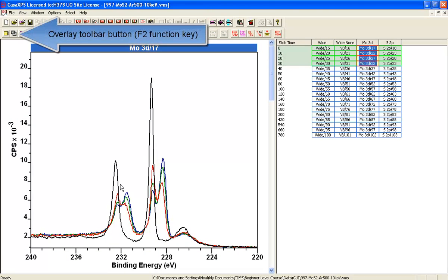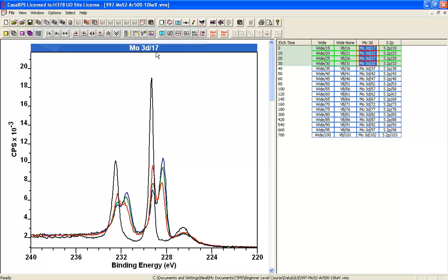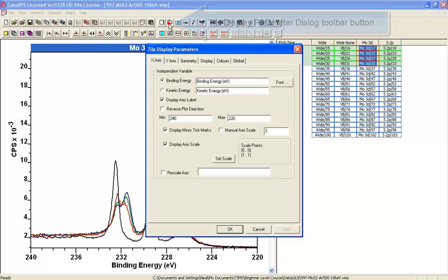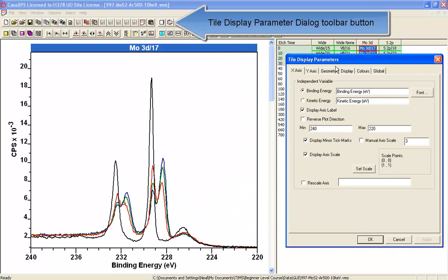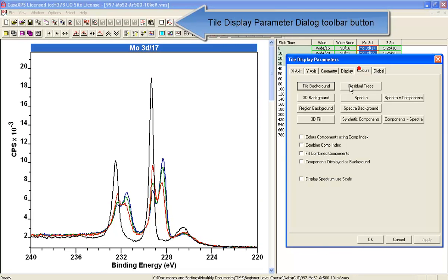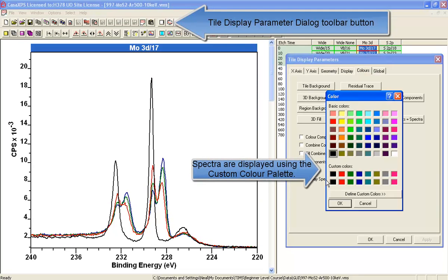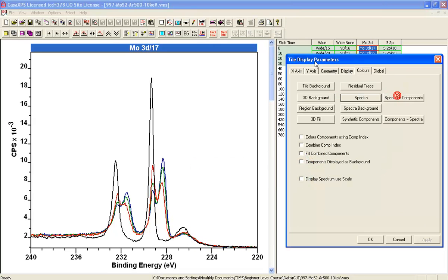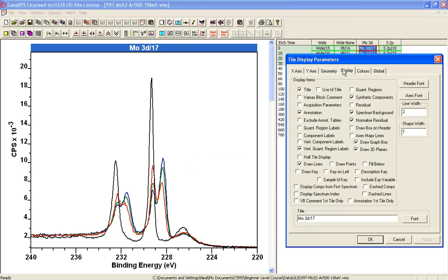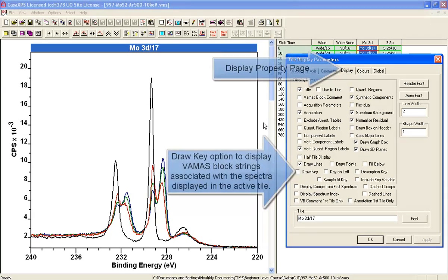These spectra are displayed using colors which can be identified in the custom color palette here: black, red, green, and blue. You can identify which one of these spectra correspond to these colors by adding a key.